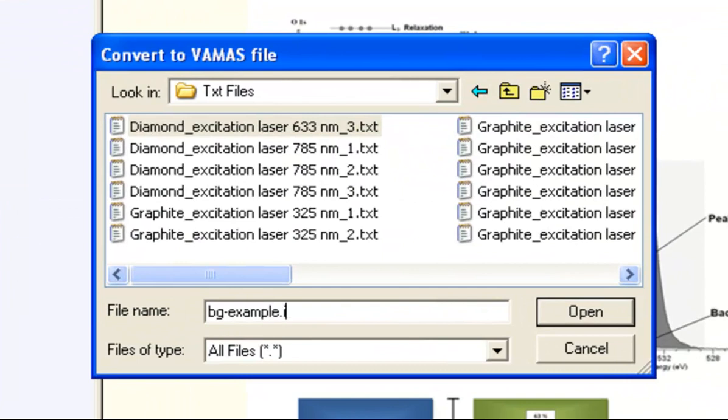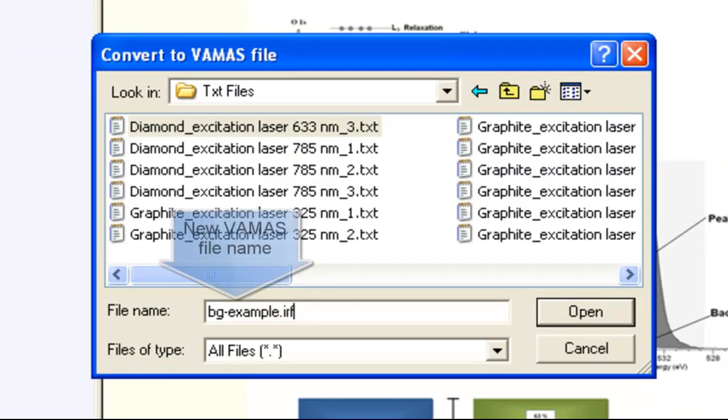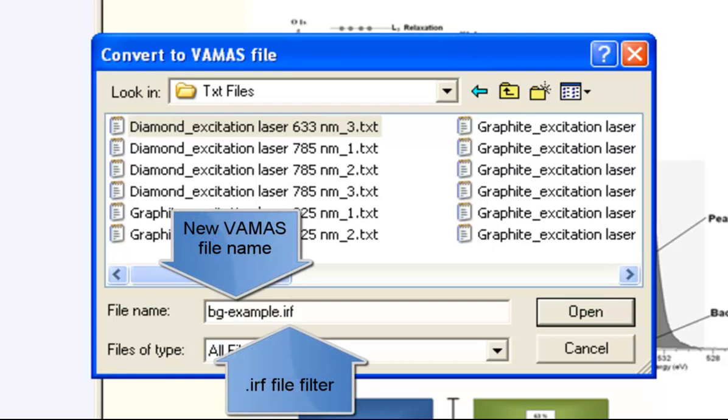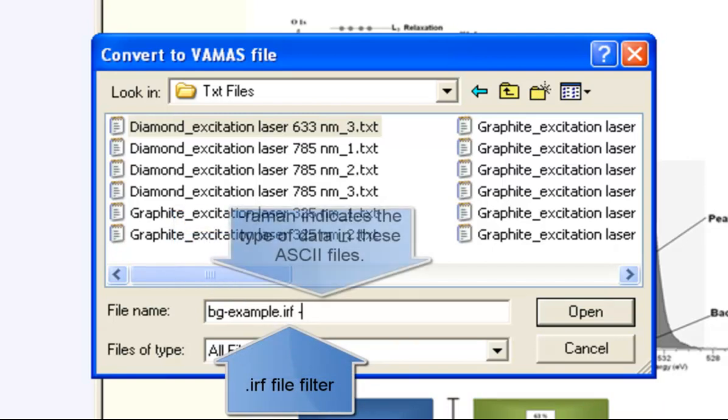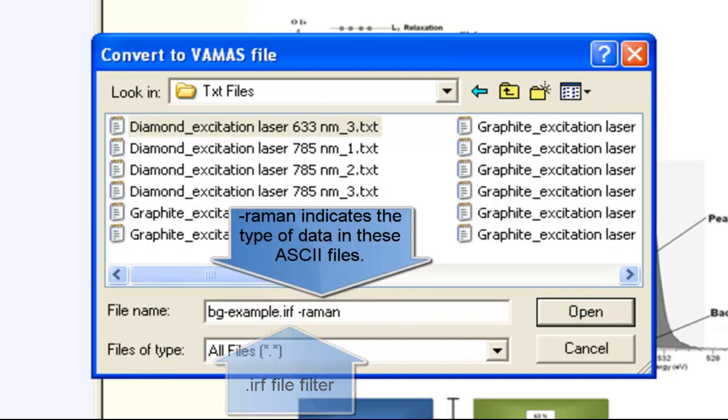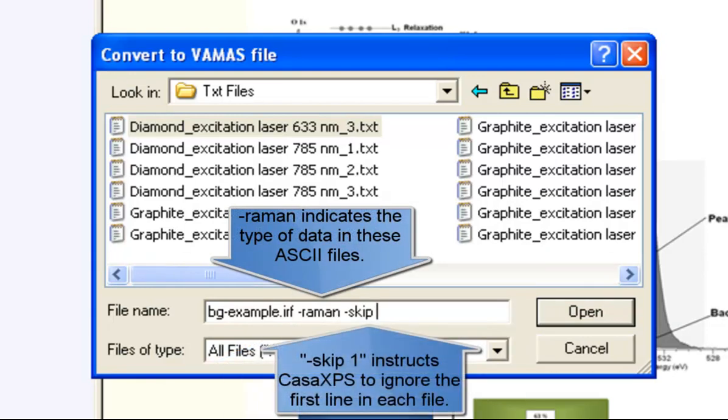And then I give it the IRF filter, so that's irregular file filter. And I need to say that we've got Raman, and I need to say we've got one header line, so I'll say minus skip one.